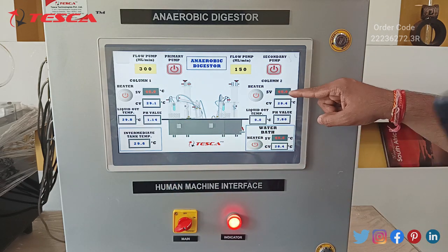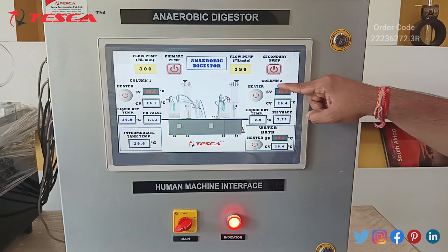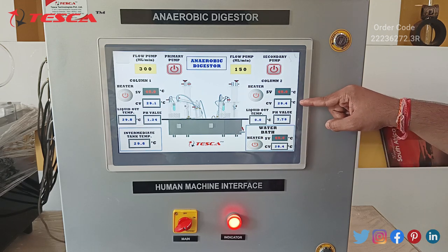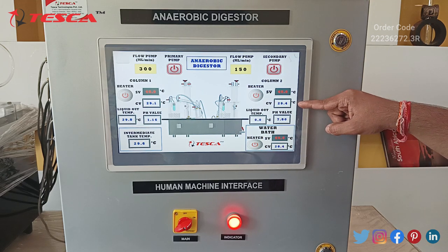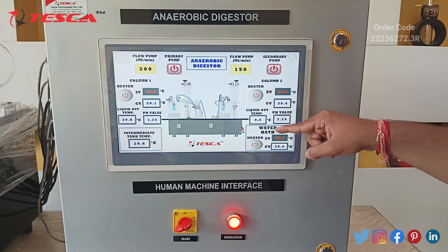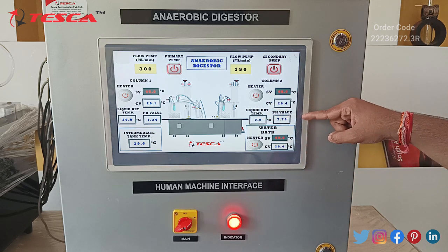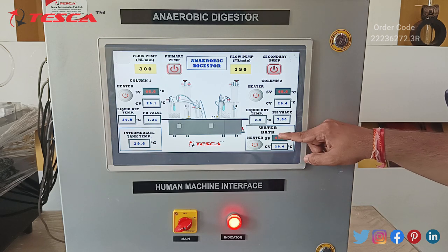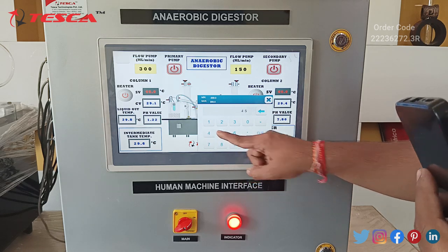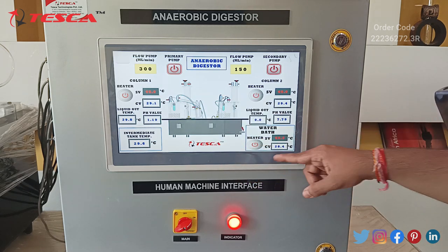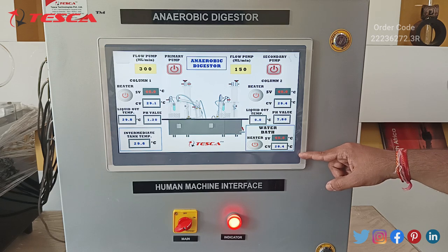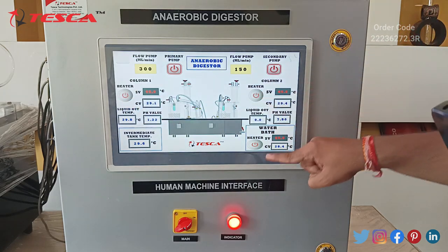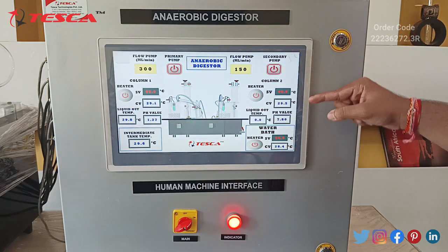For column 2, we also have a set value temperature — we will set it at 45 degrees Celsius. The current value of temperature is 29.4 degrees Celsius and we can also measure liquid out temperature and pH value of column 2. Here we have our water bath temperature measurement; we can set the water bath temperature at 45 degrees Celsius as well, with a current value of 28.4 degrees Celsius. Here we have three heater switches for column 1, column 2, and water bath.